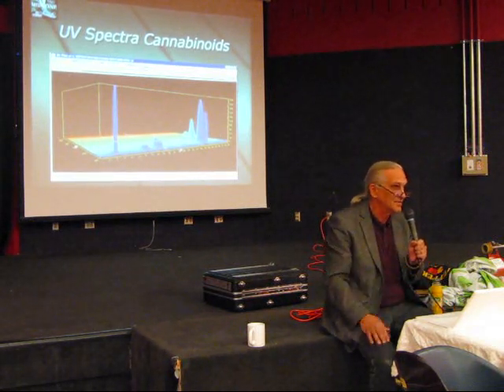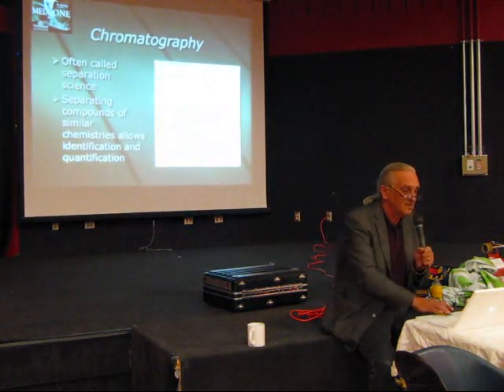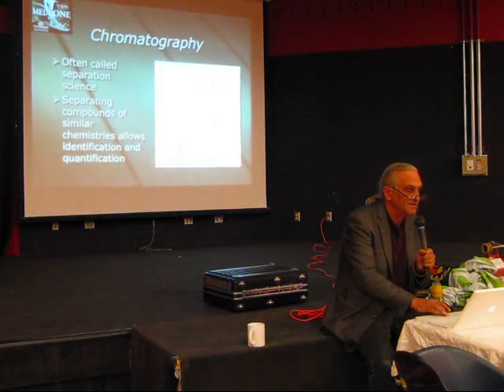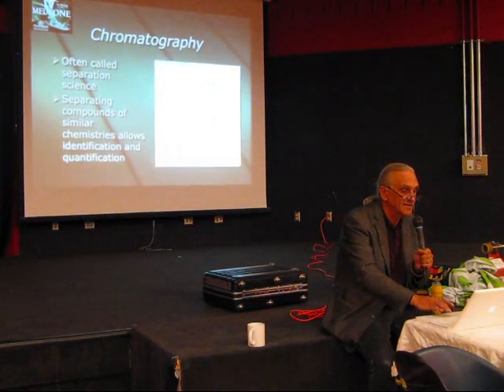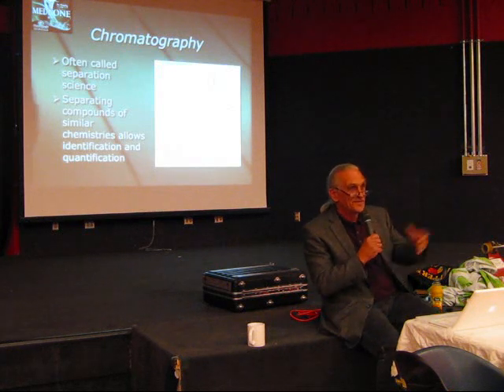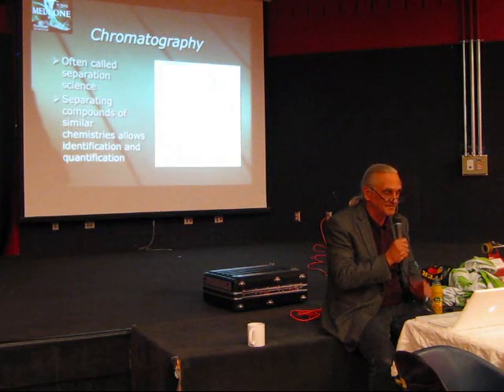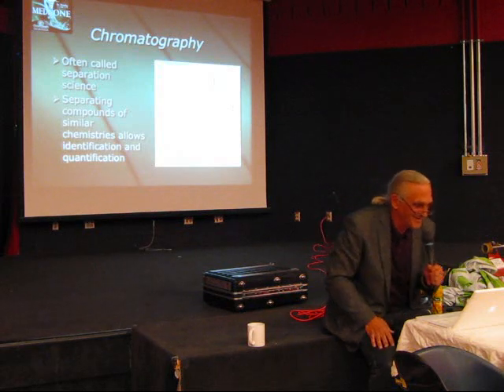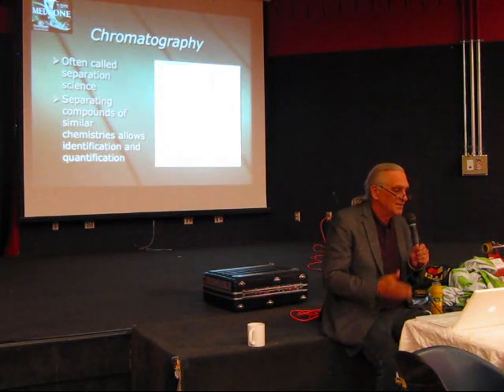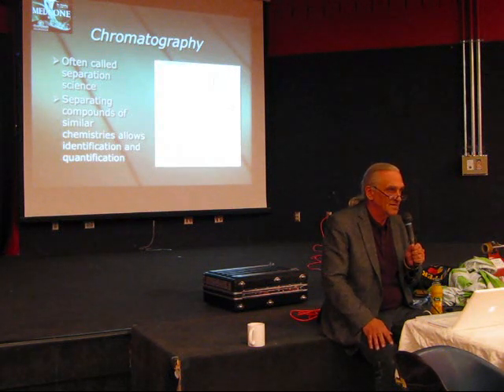This really ticks me off about BC bud, because time and time again, when I look at cannabinoids, I see this huge THC acid peak and virtually nothing else. This is BC bud, this profile right here. This is classic BC bud. It's not medicine. It's not medical cannabis. This is psychoweed. This will make you psychotic. It'll make you schizophrenic if you're predisposed to schizophrenia. This is my opinion again. But unfortunately, we bred cannabidiol out of BC bud, which is an extremely important medicinal cannabinoid.